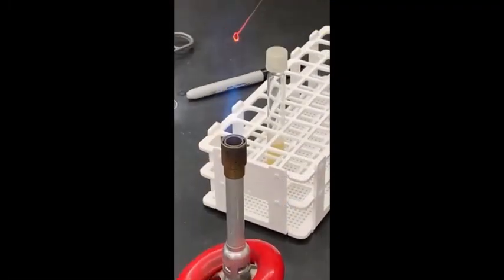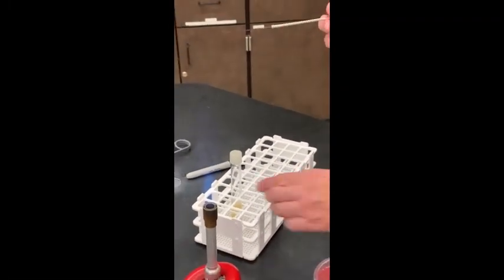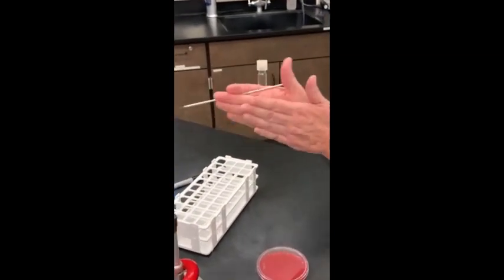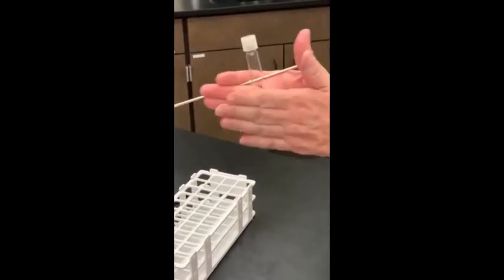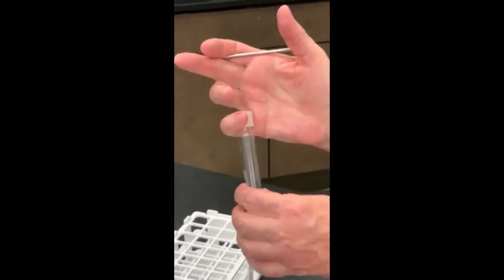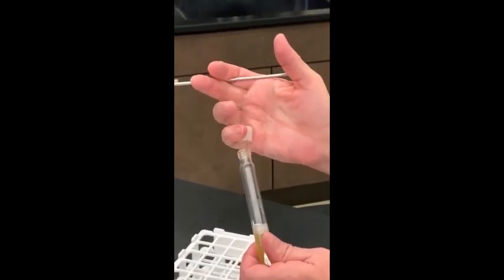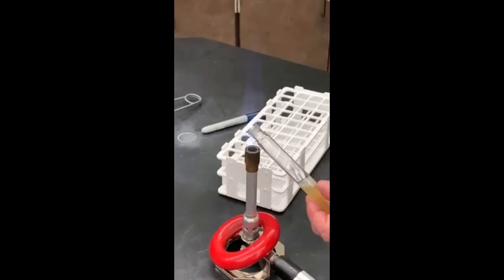If you're working from a broth culture, first you'll agitate the broth to suspend the bacteria. Then, sterilize your inoculating loop and aseptically transfer two to three loops full of bacteria to a clean slide.